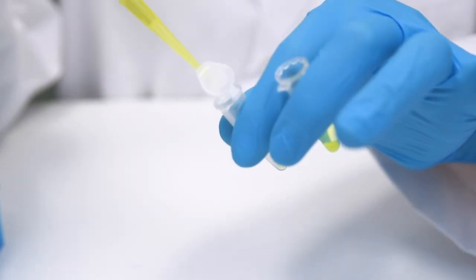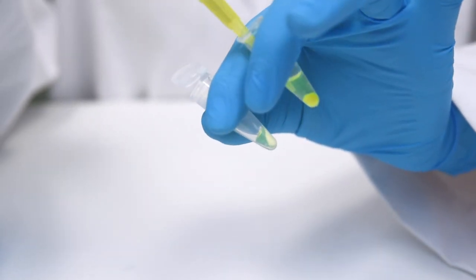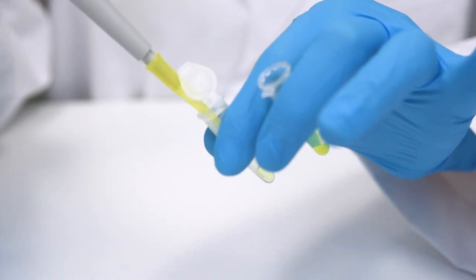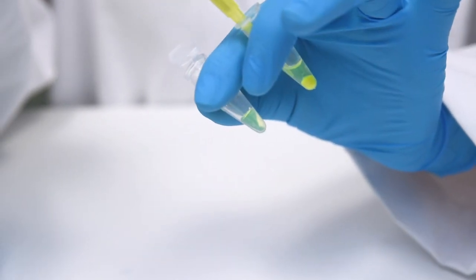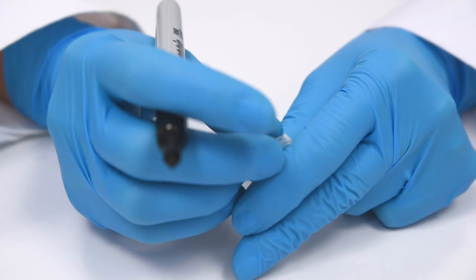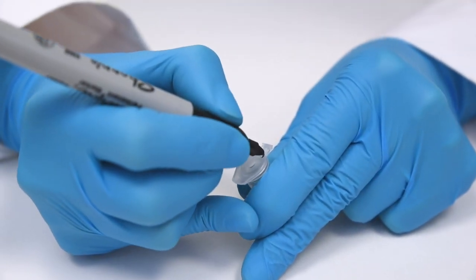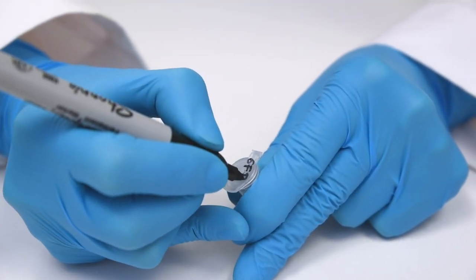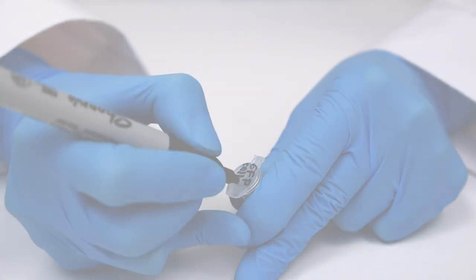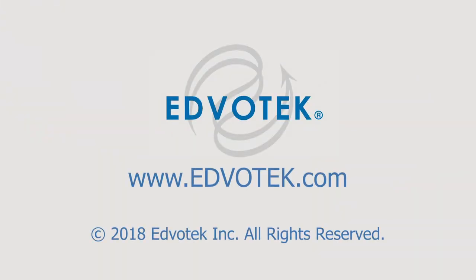Step 12: Transfer 200 microliters of glowing supernatant to a clean tube and label it GFP cell extract. Store the extract and any leftover supernatant in the freezer for use in Module 3 Purification of GFP by Column Chromatography. You are now ready to proceed to Module 3.